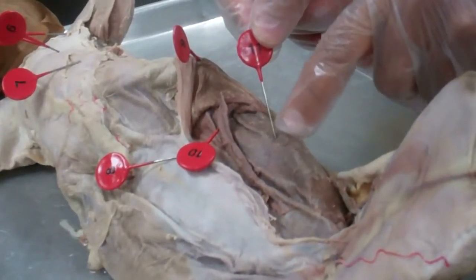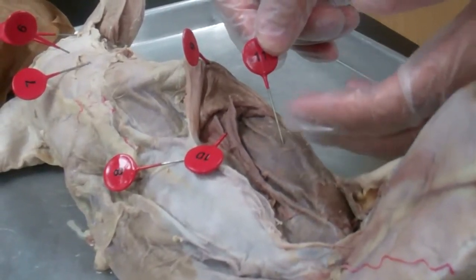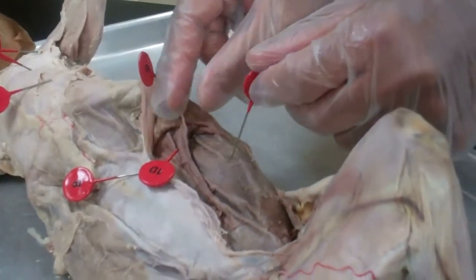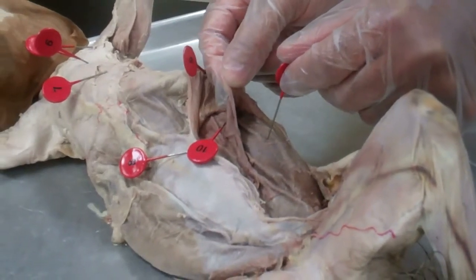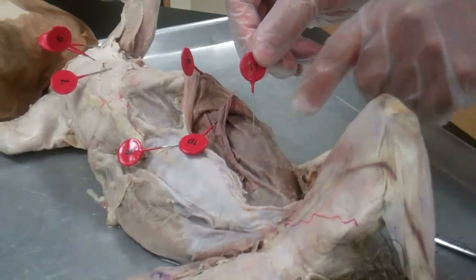If you cut through this muscle, you will see the viscera, the intestines, and the other organs, which you do not want to do. So that's why you have to be very careful to separate out these three layers of muscles, because they're very, very thin. You do not want to cut into the transverse abdominal muscle.